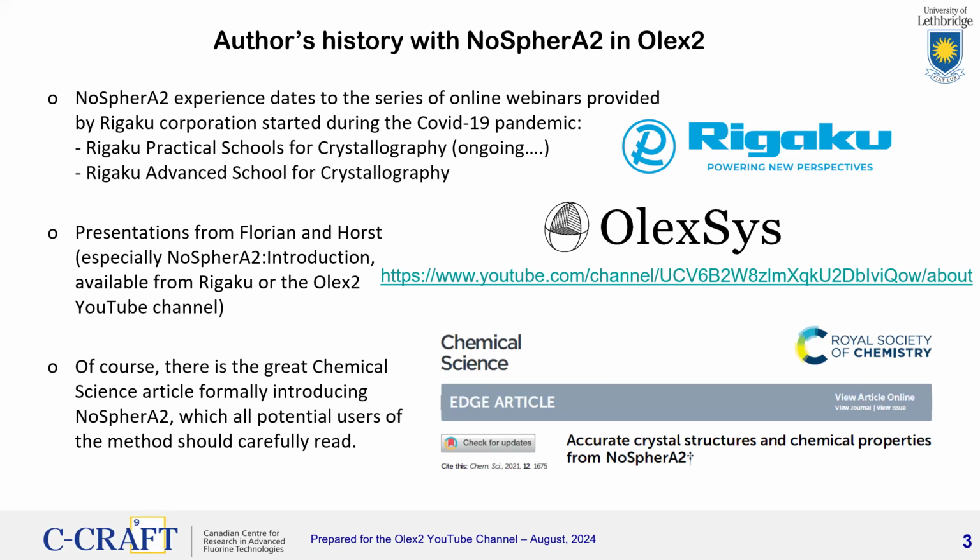Then at the end of 2020, there was an important publication in Chemical Science, where the NoSpherA2 method was formally introduced, and this article gives all kinds of background information and theory, much more than I can give in this webinar. So I encourage you to look at that article and read it before you try to implement the method yourself, should you be interested in doing so.